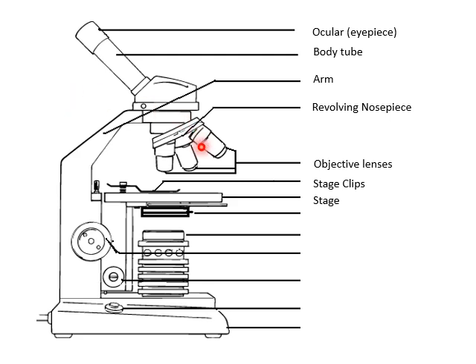This next thing, this is the stage. So this is where the specimen is going to be resting. There's a hole in the center so that the light can shine through, and you'll put the microscope slide on so the light shines through the bottom of the specimen.